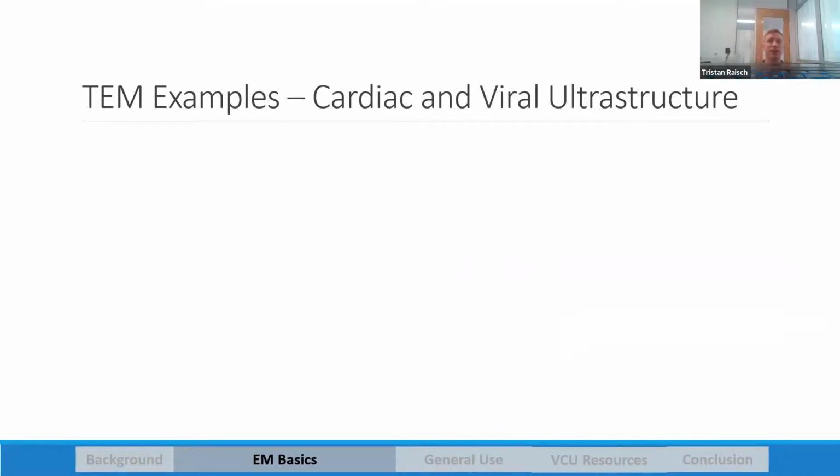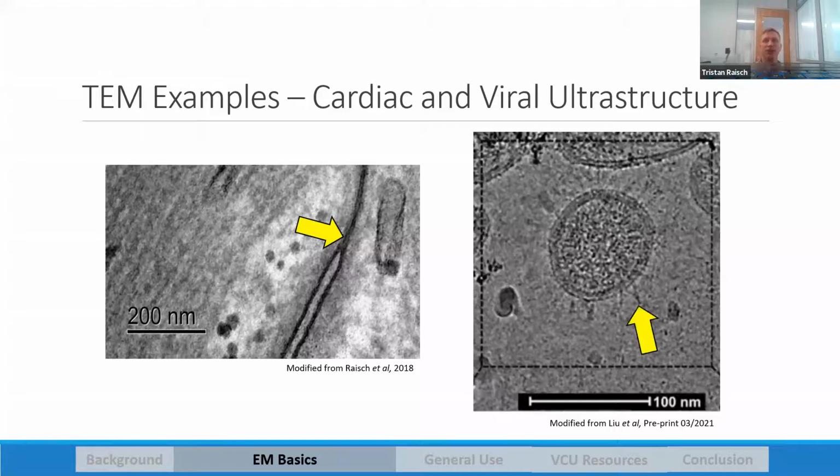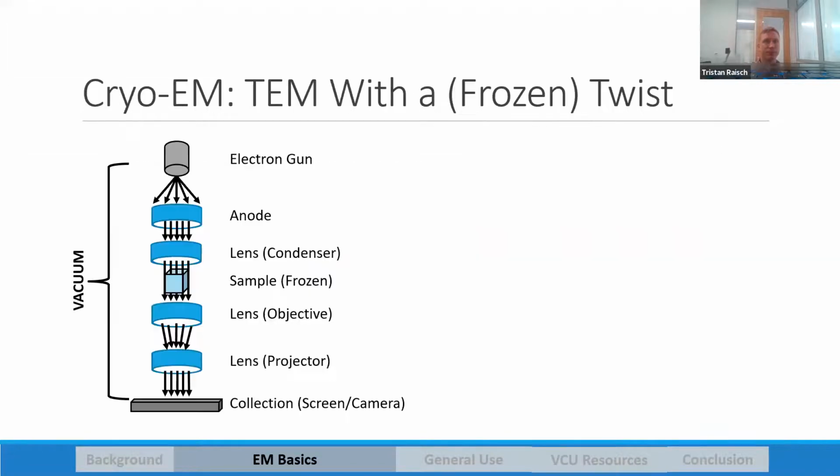The main takeaway here is that TEM gives extremely high magnification cross sections of a given sample, whether that's within a cell-cell junction, where you can even see the characteristic gap, which gives gap junctions their name, or to identify spike proteins on the novel coronavirus.